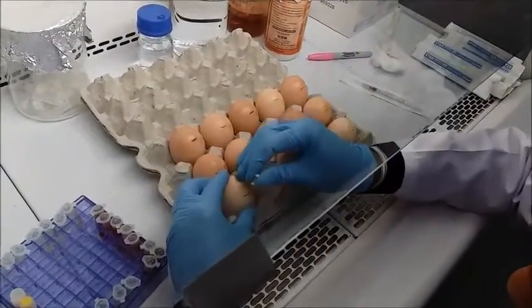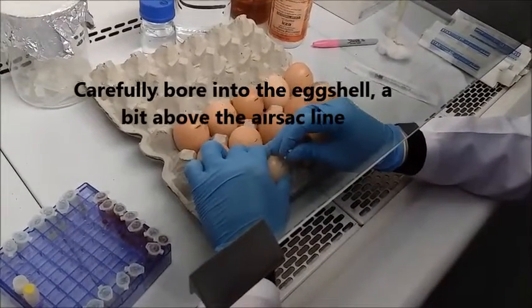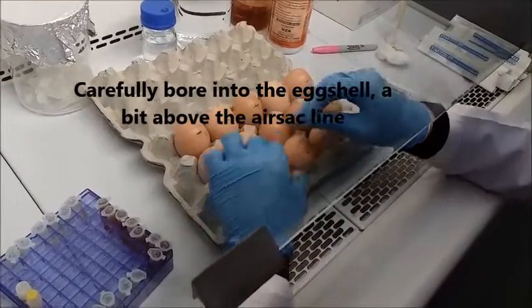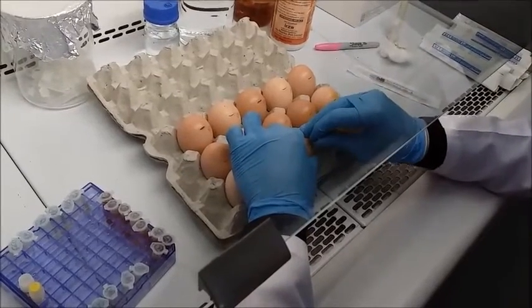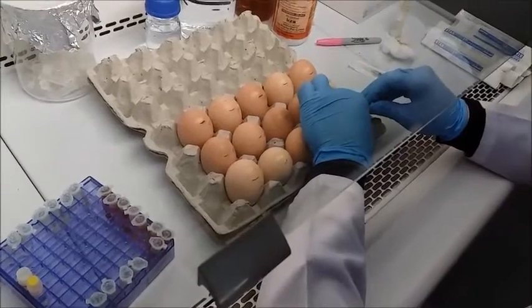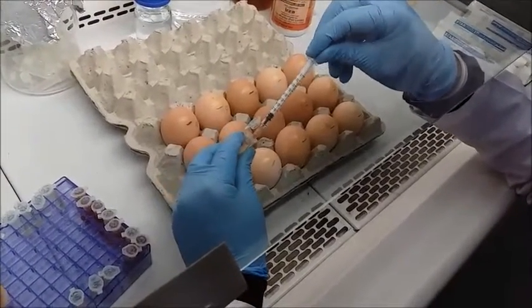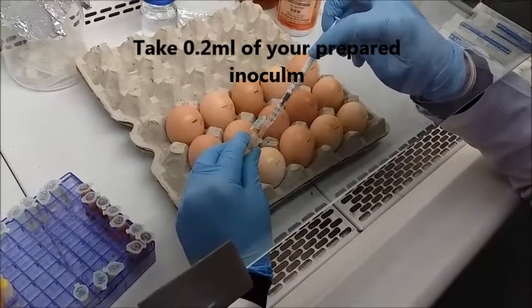Okay, the first thing you need to do is pinch a hole into the shell. Be careful, and you can use an egg borer or you can use a thumb pin. It depends on you. Okay, so we are going to inoculate around 0.2 ml of our sample, and he's using a syringe.